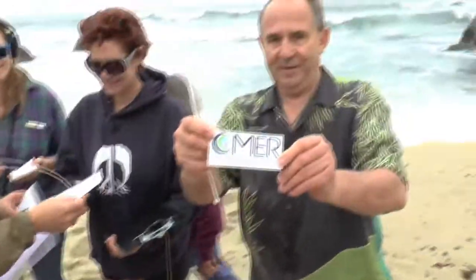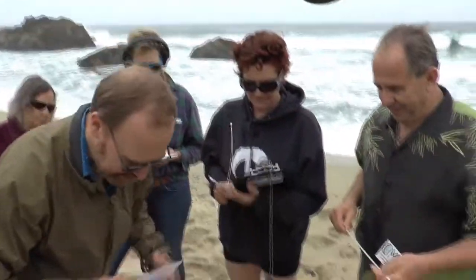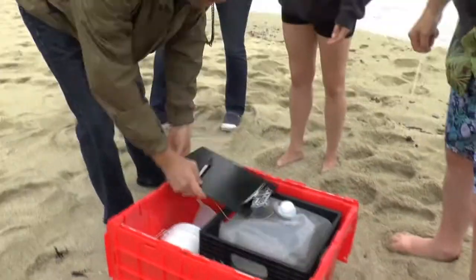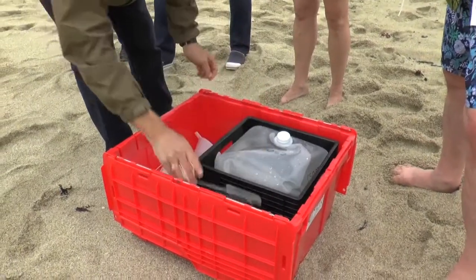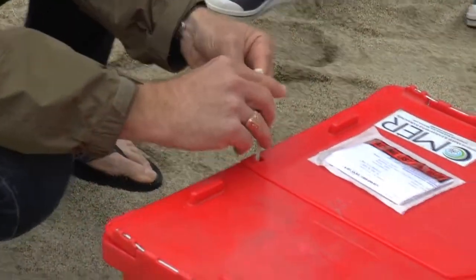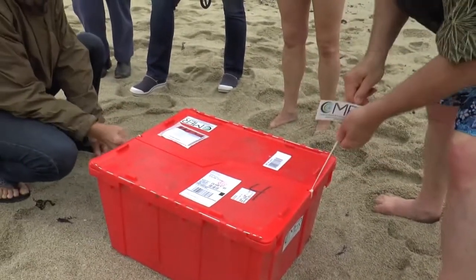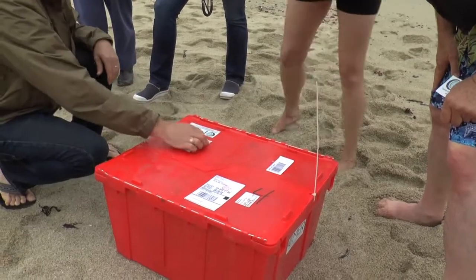You have to hold on to this. Let's close it. The clipboard goes back in. Close it contained — go through the set of holes with the tie wrap, close it down. And then we'll attach this label later, right over the other label.